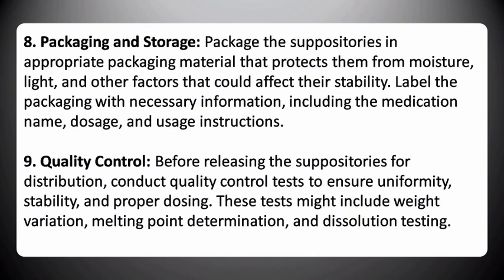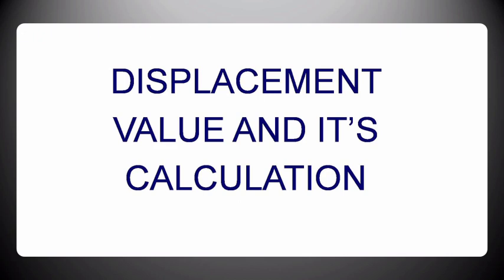Ninth, quality control. Before releasing the suppositories for distribution, conduct quality control tests to ensure uniformity, stability, and proper dosing. These tests might include weight variation, melting point determination, and dissolution testing. Now, displacement value and its calculation.